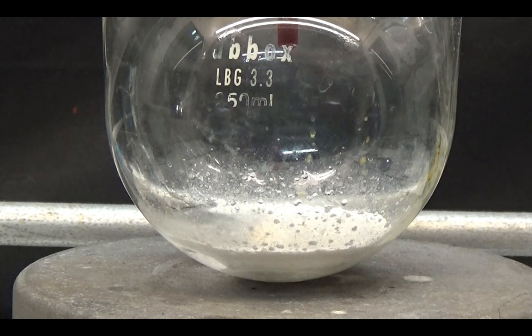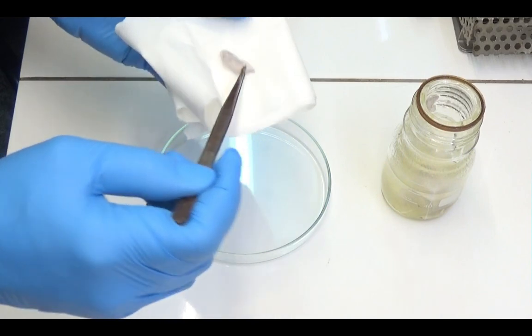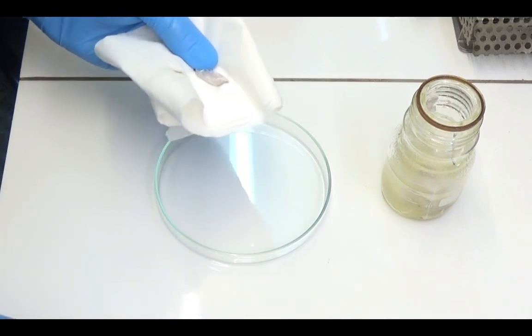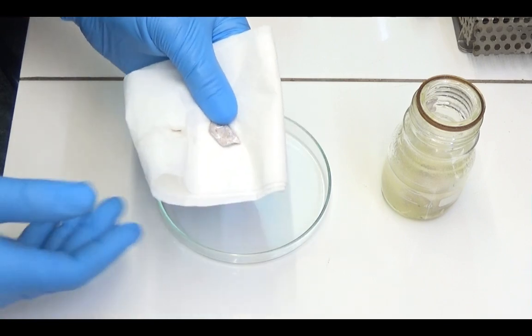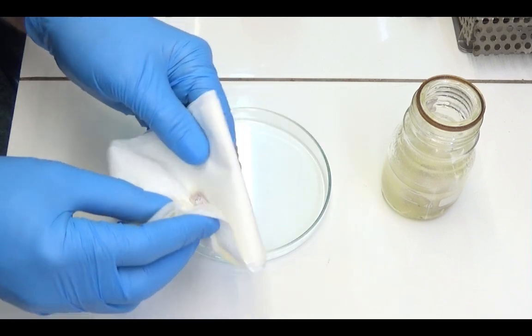The initial step we will take is to prepare sodium ethoxide. We need sodium metal that has been freshly cut and washed with hexane. Sodium can cause severe burns and fire if it comes into contact with water, making it very dangerous.